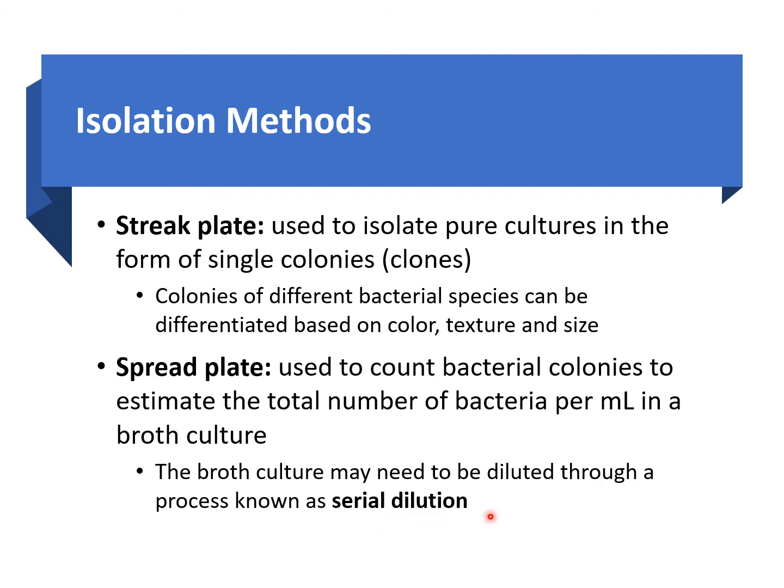And then after we dilute out our broth medium, which has been inoculated with our bacteria, we inoculate our plates.